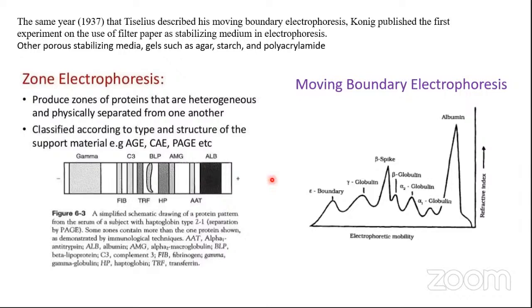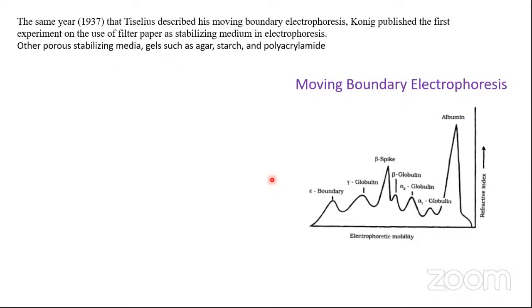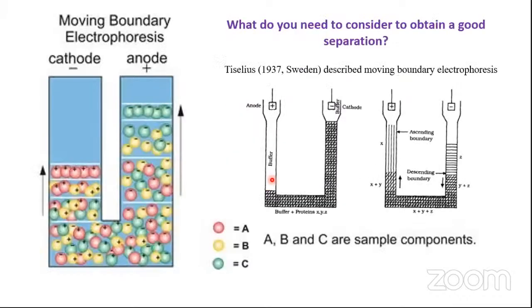However, as we have seen in the last slide itself, even after the separation has happened, this area is of the molecules which are not completely separated. Some portion of those molecules have already migrated to different zones, but those zones are very limited.